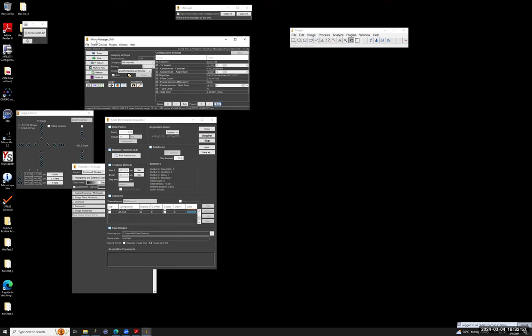And another issue that we encountered is that sometimes people don't use fluorescence, they use only transmitted light, maybe bright field, phase contrast, DIC, maybe bright field and phase contrast, but no fluorescence. And in this case, the problem was that Micro-Manager, because there were settings in the hardware configuration which involved the epifluorescence lamp, gave an error when the lamp was not on, and we couldn't start Micro-Manager. Having to switch on the epifluorescence lamp when you don't want to use fluorescence would be wasteful of the lamp hours.